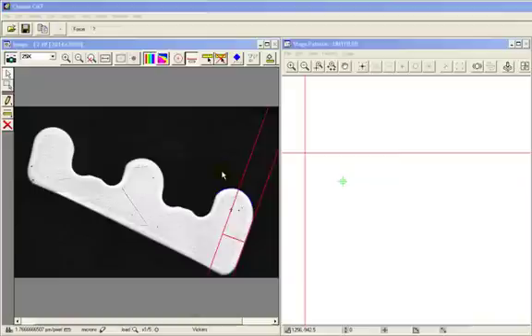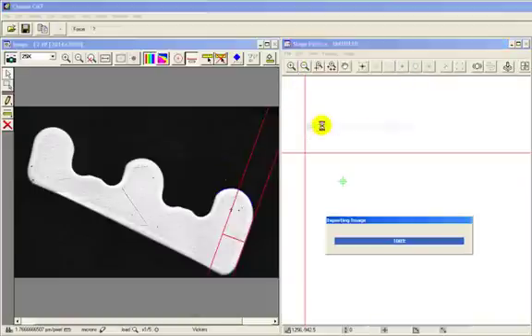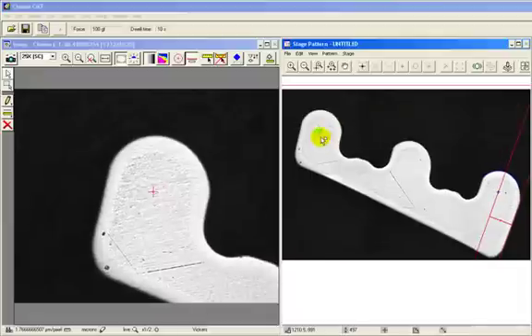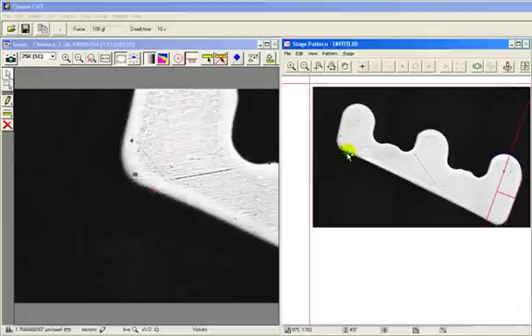With our layout completed, we will set the image as the background of our stage pattern window. You can now use the pattern window to pinpoint locations of interest on your sample.